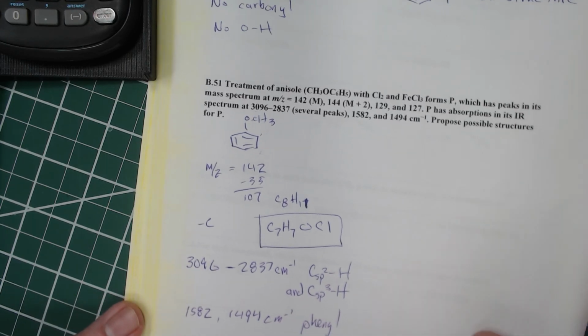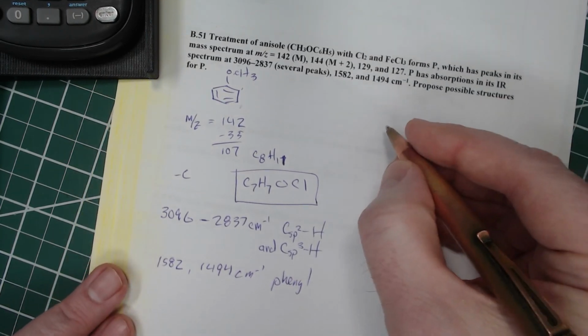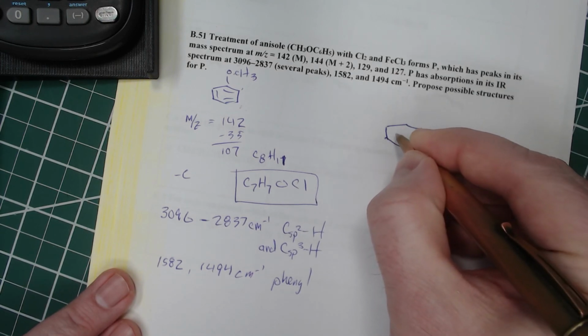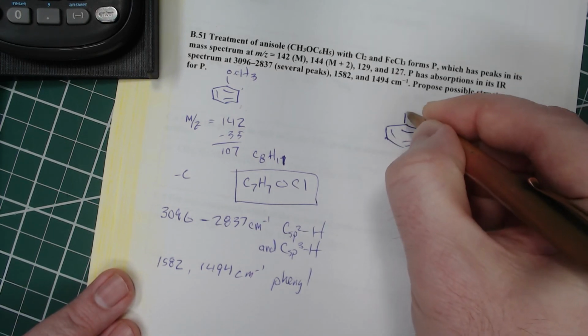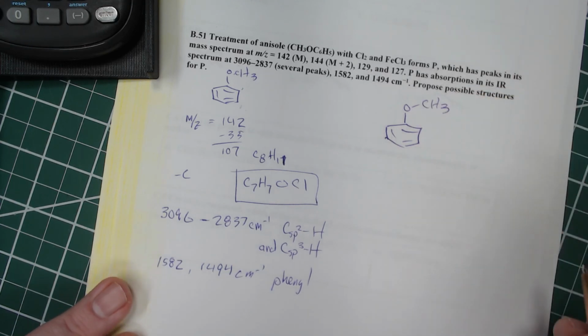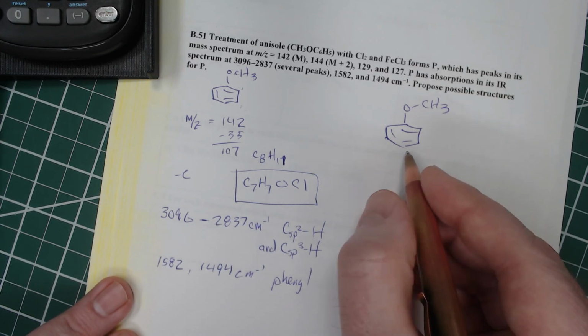All right, so here's what we know. There's possible structures we could have here. One possibility is that we've replaced one of the hydrogens on here with a chlorine.